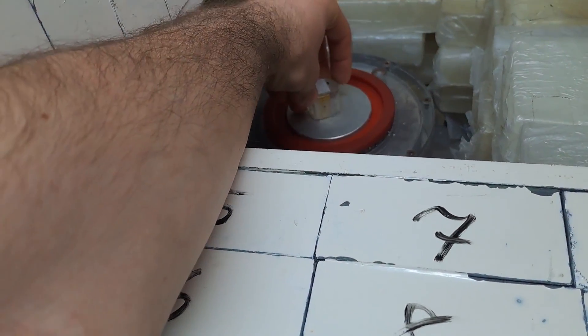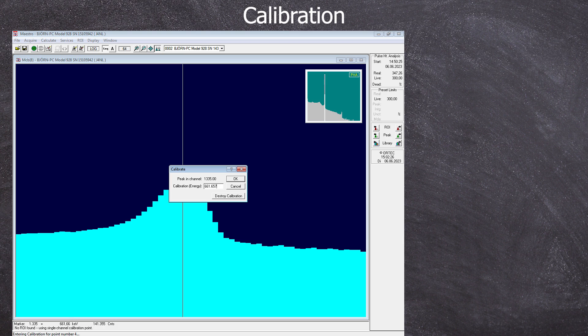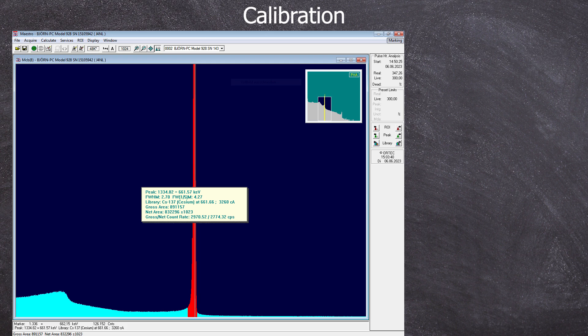Next, we move to Cesium-137. Here, we also have a very distinct peak. We can assign the energy of 661 keV to the channel 1335. Note that the program only accepts periods and not comma. The background corrected counts measured in the ROI were 2774 counts per second in total.